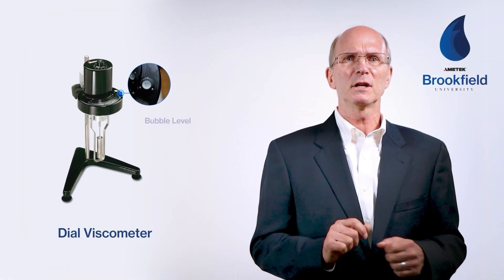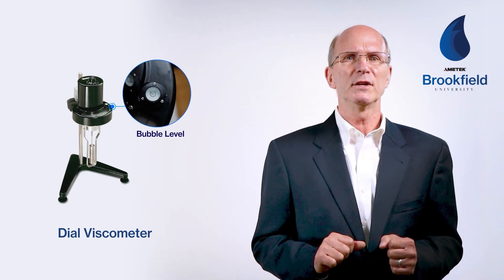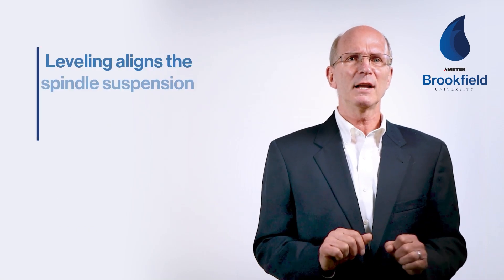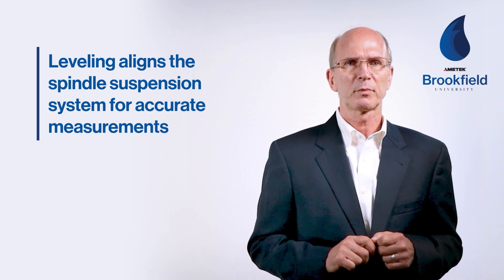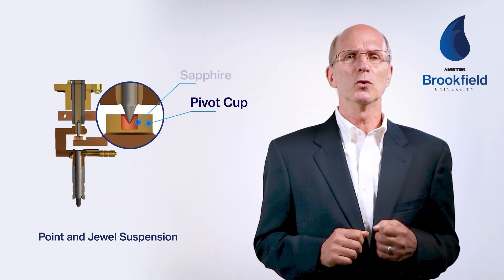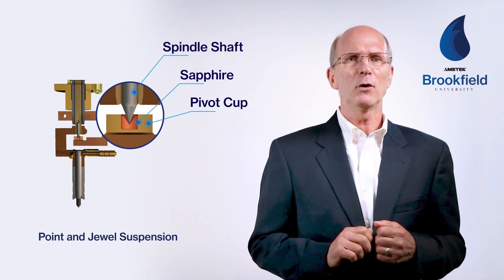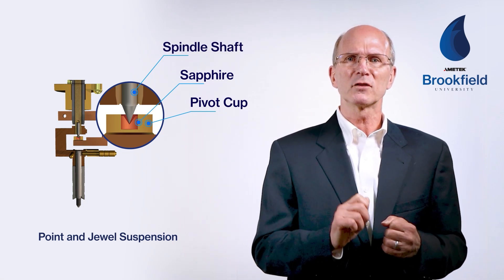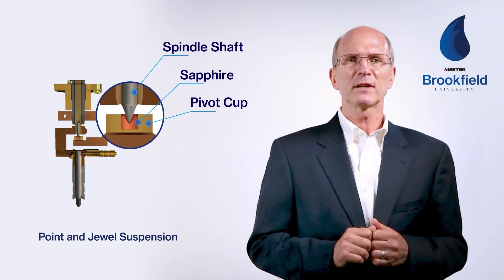You'll also notice that all our viscometers have either a bubble level affixed to the instrument or an electronically displayed bubble level. It's very important to have the instrument level for all testing. This aligns the spindle suspension system, allowing for an accurate measurement of the fluid's resistance to flow. This suspension, shown here with the jewel bearing, is protected by the pivot cup. The synthetic sapphire jewel supports the point of the spindle shaft that rests on the jewel. Any out-of-level condition will result in the point not being centered in the jewel, adding mechanical resistance to the spindle. This will affect the instrument's accuracy.